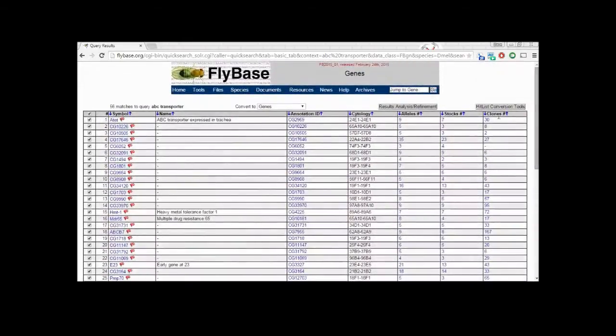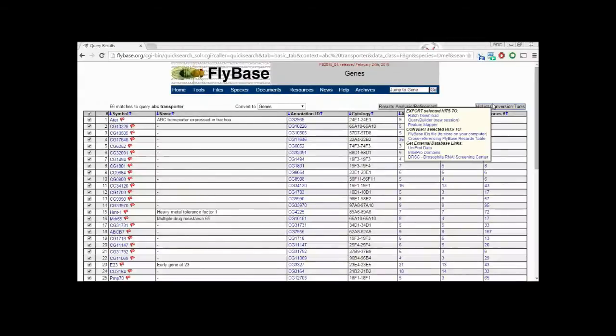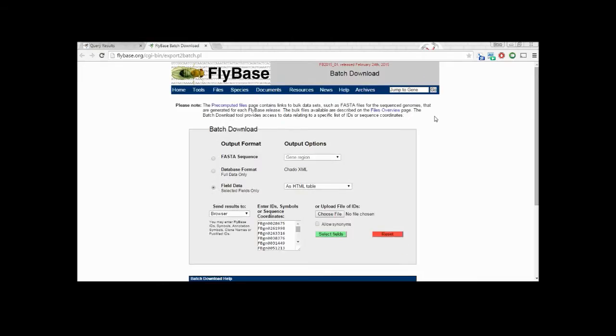To be able to see the data in a manageable way, we click on the hit list conversion tools, then on batch download.